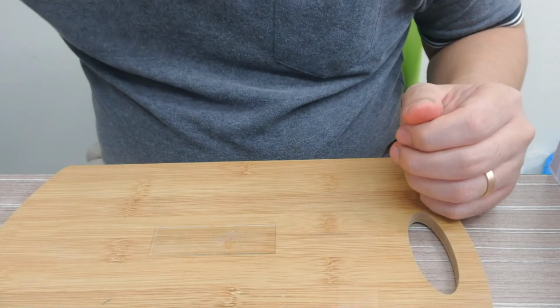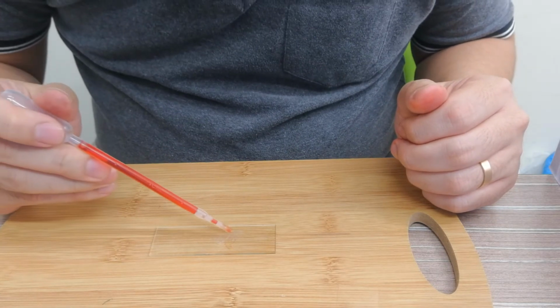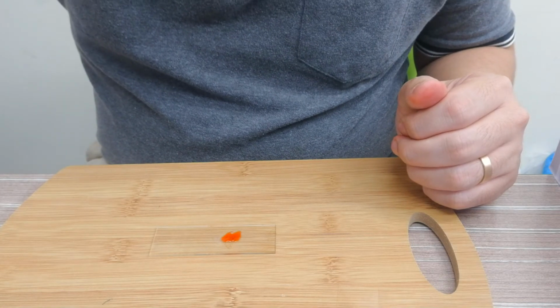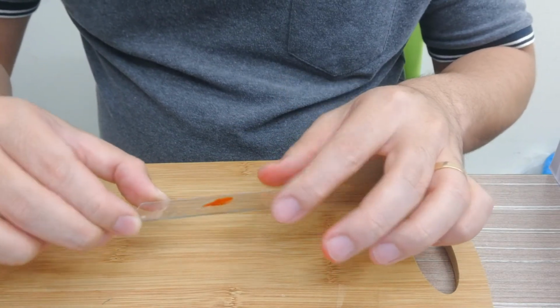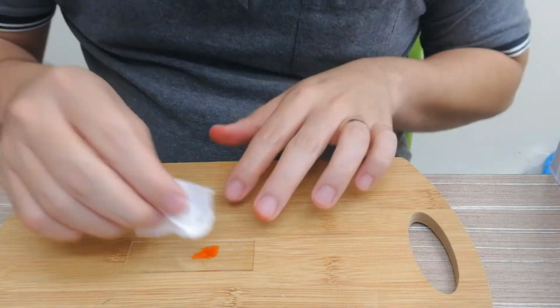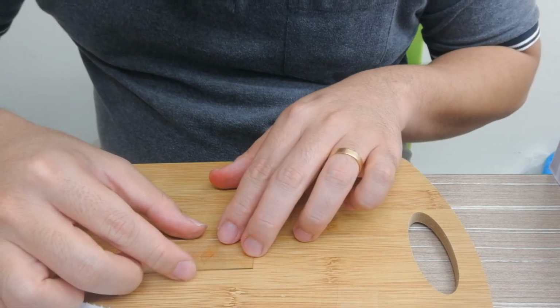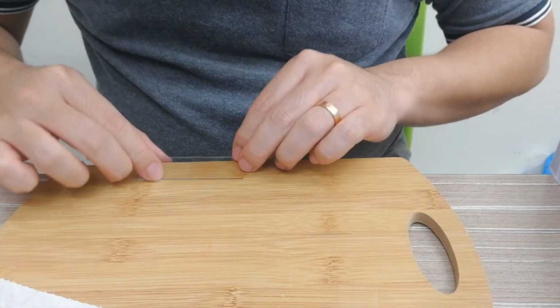Then only you add a drop of food coloring. You can use iodine or you can use food coloring. In this case, I'm using red food coloring. You may need to wait around 3 minutes so that the cell absorbs the food coloring. Due to time, I just wipe it clean, and I'm going to close it with my microscope slide cover. You can press a bit so that it sticks together. Now mine is done.